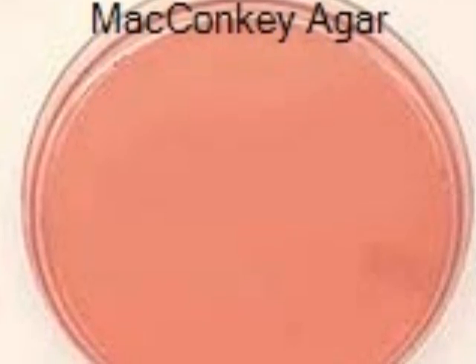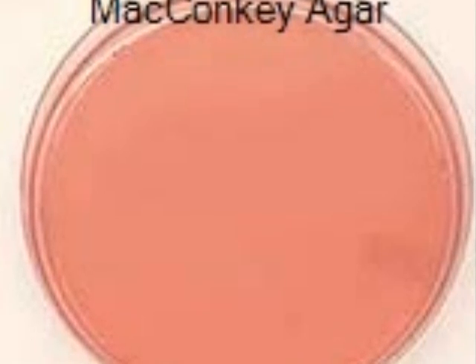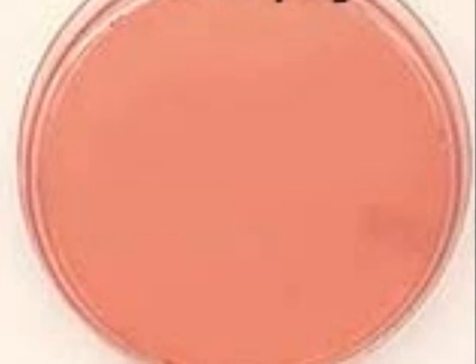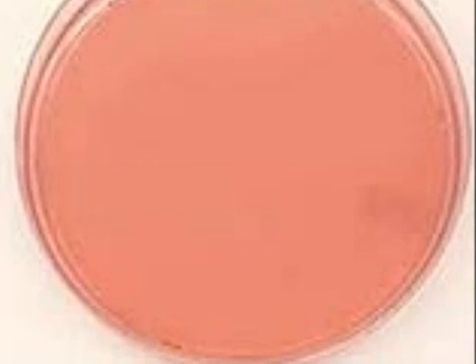On this MacConkey agar plate, you can observe there is no growth. Therefore, the interpretation would be, microbe did not tolerate bile salts and crystal violet, and is most likely gram-positive. You cannot interpret the differential part because there was not good growth.